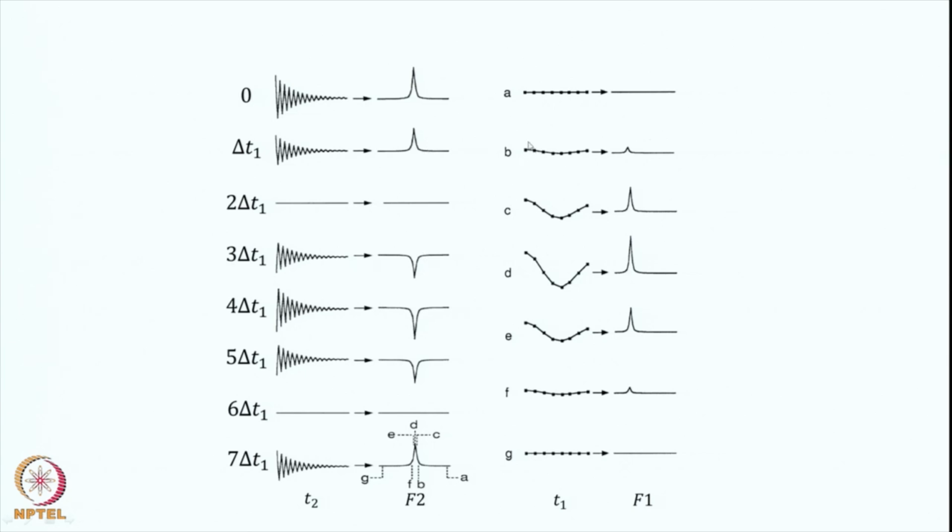So initially, therefore, this is going down. See along this axis, what is it now? This axis is T1, because what is varying as you are going along is the T1 increment. Therefore I want to call this the T1 variable. This is the T1 time axis here.